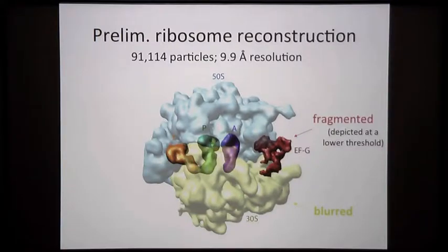If you have a very well-studied system with known structural states, for example, a ribosome, that would perhaps be relatively easy. If you have anything that's not a ribosome, it's probably hard to know what kind of structural variability there is. So if you had to come up with some informed number of different references that would describe such a heterogeneity, that might be difficult, and more importantly, it would also be very dangerous because of model bias, because you might bias your entire classification on something which you think is true, but isn't. So it turned out that these maximum likelihood classification algorithms are a good solution for that.